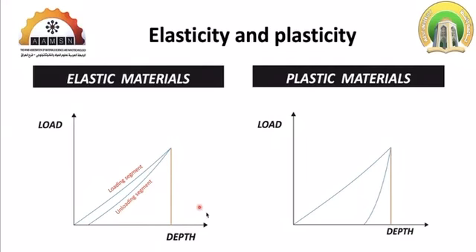Okay. So the most important segment of this simple curve is the unloading segment. If you think about it, when we decrease the load, the depth of the penetration decreases. And as everyone knows, even inside the plastic deformation region of the material, we have elastic deformation.